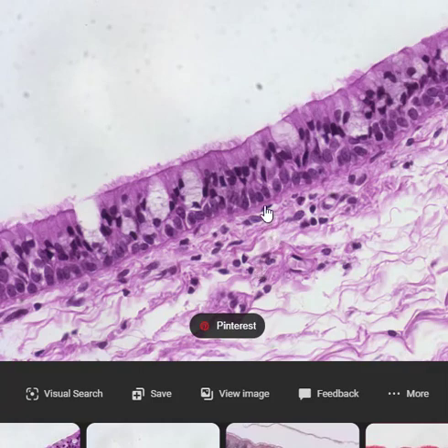But if you look, you think, oh, look, there's a row of nuclei right there, and here's a row of nuclei right there. So that must be 2 layers. But if you were to zoom in a little tighter and look at it, you're going to see that here's the top of the cell, and there's the bottom of the cell. Here's the top of this cell, there's its nucleus, and there's the bottom of that cell right there. So this is 1 cell layer thick, but the nucleus has got you tricked into thinking it's 2 layers. But you have to look very, very carefully.